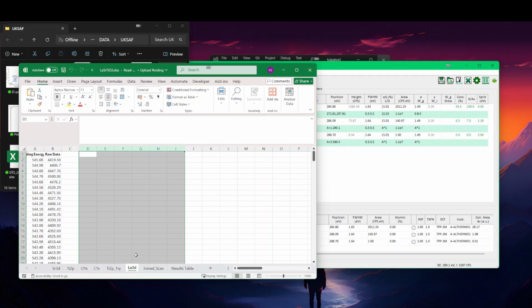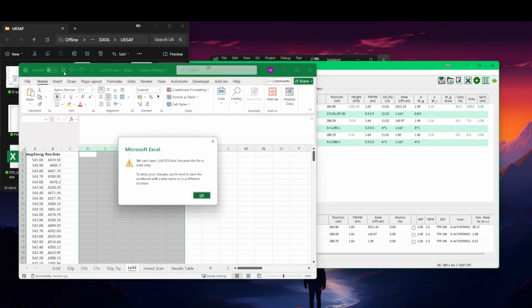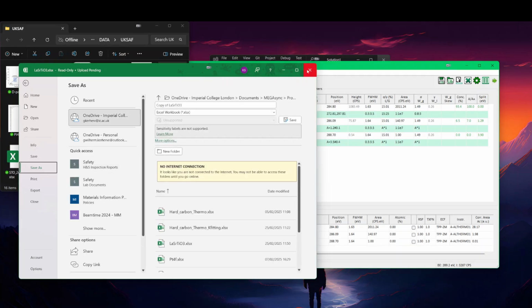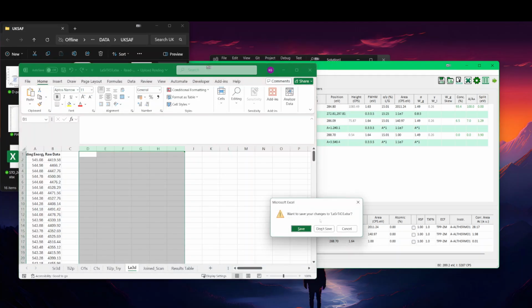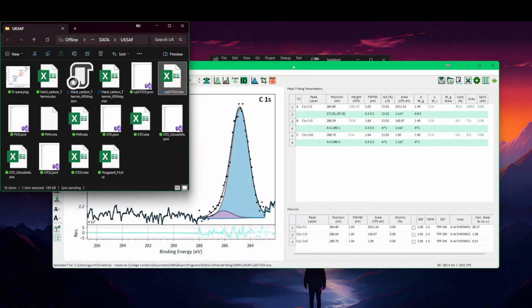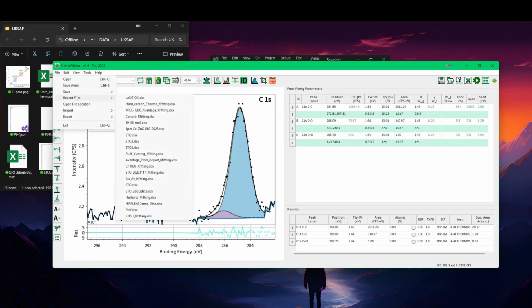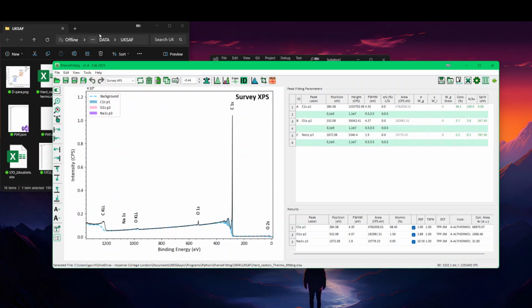It's not LA 3D, but let's say I've added LA 3D. So I save that. It may say that I can't save the data because it's read-only. Okay, so I will not save that. I have to close the program, unfortunately, I think, or simply open a new file.